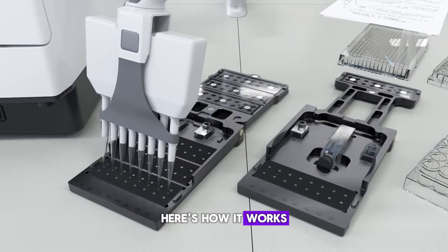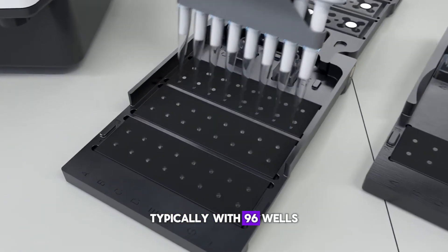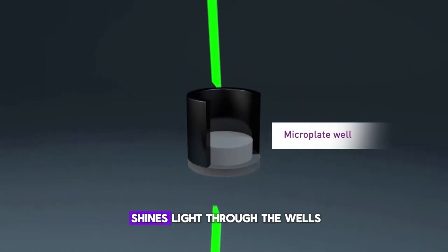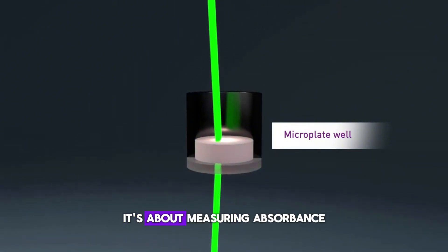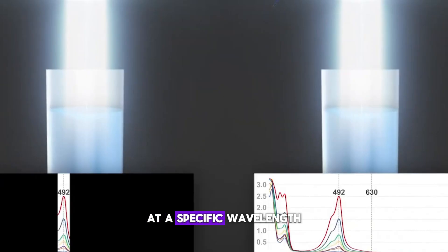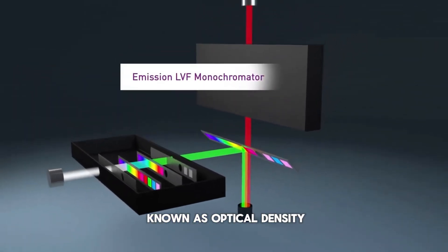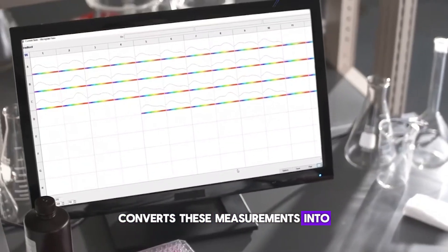Here's how it works. The ELISA assay takes place on a microplate, typically with 96 wells. Each well contains a sample, and after the biochemical reactions occur, the ELISA reader shines light through the wells. It's not just about shining light — it's about measuring absorbance. Each substance in the well absorbs light at a specific wavelength. The ELISA reader measures how much light is absorbed, and this value is known as optical density, or OD. The machine then converts these measurements into numerical data, which is essential for determining the concentration of the analyte you're studying.